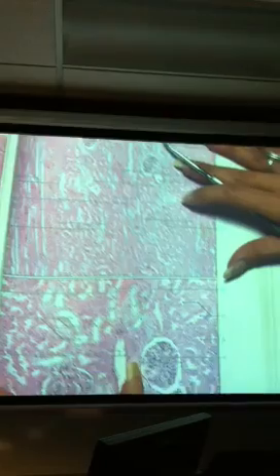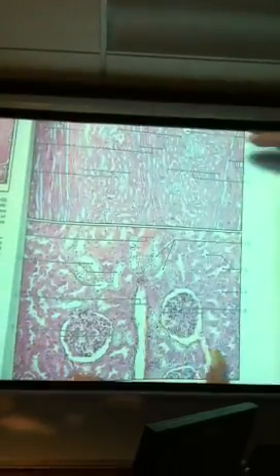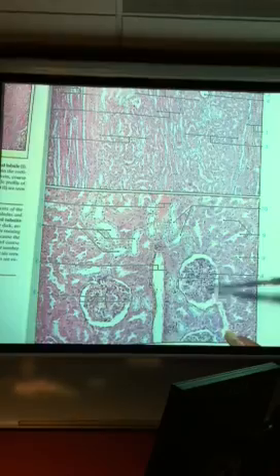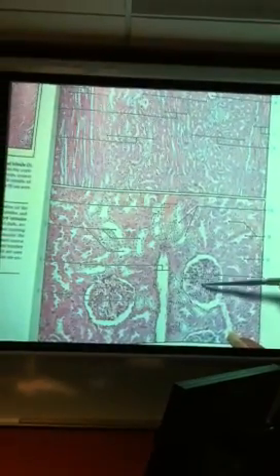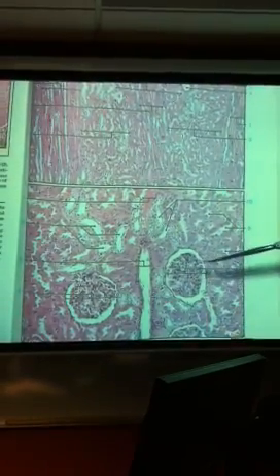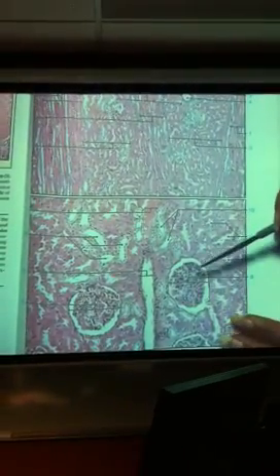Now, if you take that renal corpuscle and look at it under high magnification, this is what you see. On the inside, we see the glomerulus. Then you will see what looks like an open space. That open space is actually Bowman's capsule.